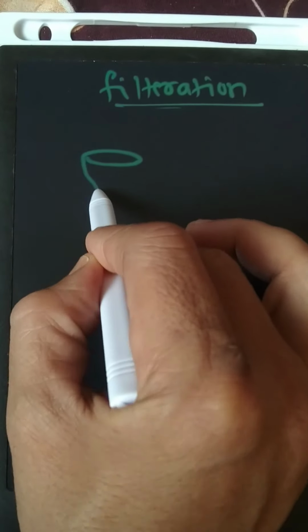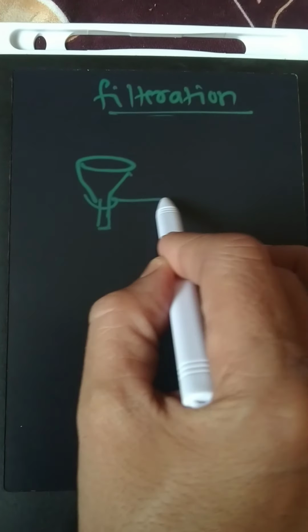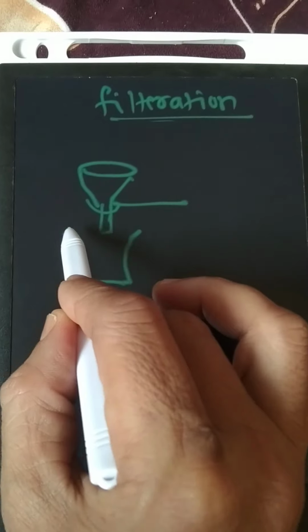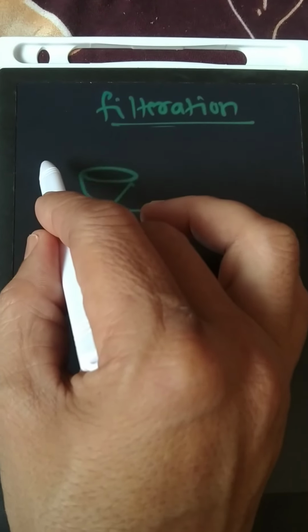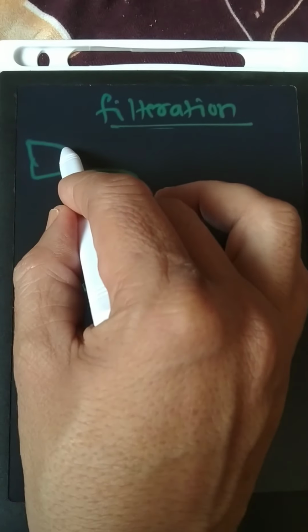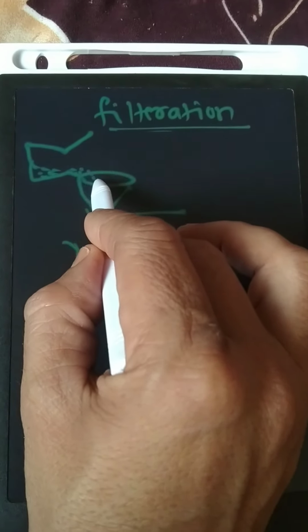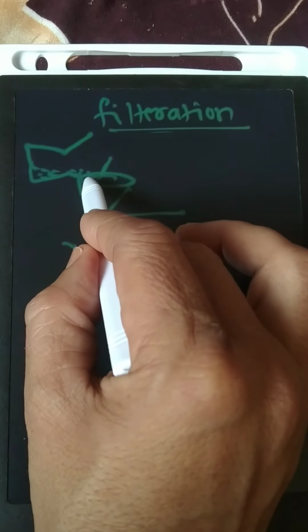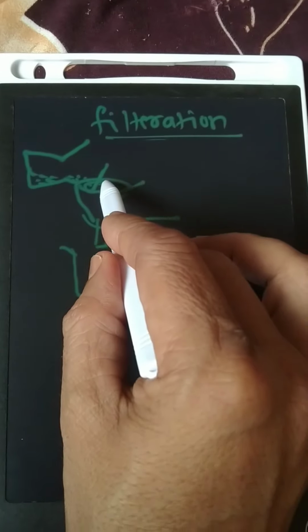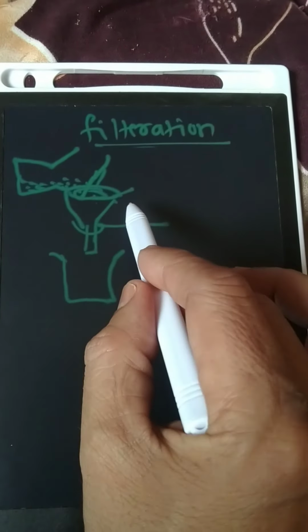On a glass funnel attached to a support, we collect the solutions in the beaker or flask. The beaker containing the Fe(OH)3 precipitate is added on the funnel containing the Whatman filter paper. On the glass rod, step by step solutions are added to the funnel.